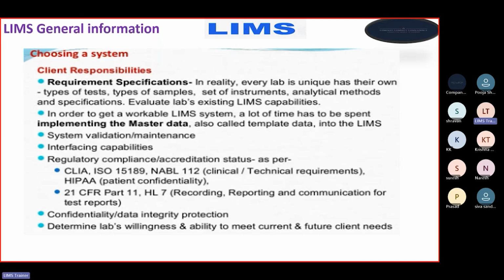Evaluate the lab's existing LIMS capabilities. In order to get a workable LIMS system, a lot of time has to be spent implementing the master data, also called template data, into the LIMS. System validation and maintenance, interfacing capabilities. So LIMS can interface with instruments. LIMS can interface with ERP systems like SAP. That capability also needs to be checked by the client: if any LIMS software can interface with instruments, and if it can interface with their SAP software, right?